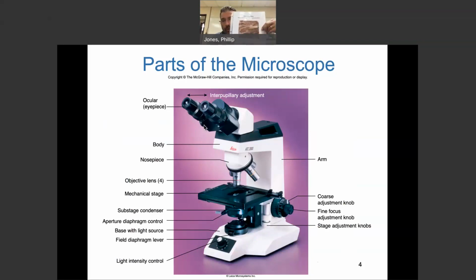So this would be a Demodex. Hold on one second. So that would be the Demodex. All right, that is actually a lash mite. That's what grows on the eyelashes. So we want to make sure that we wipe that off. And please realize if you're wearing fake eyelashes and stuff, they like to grow in that.